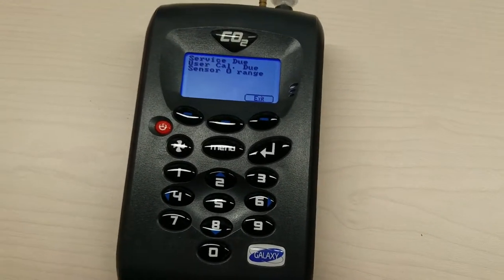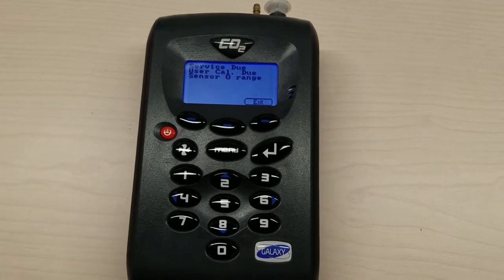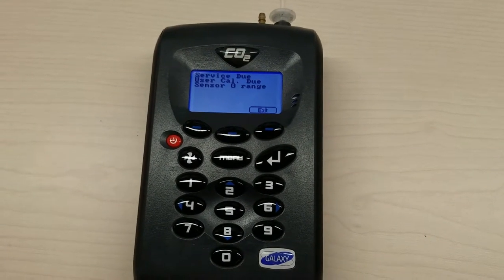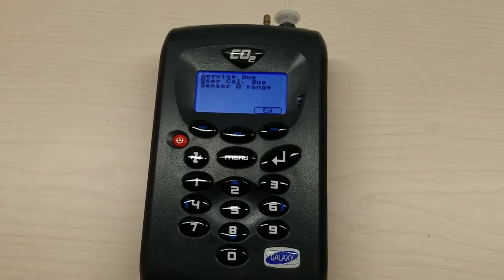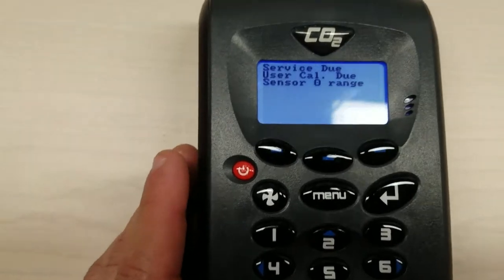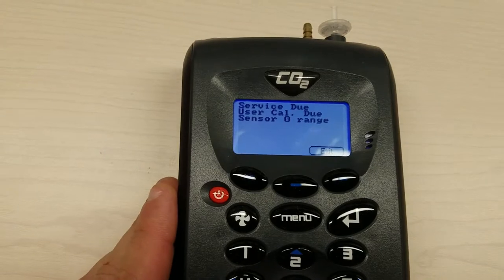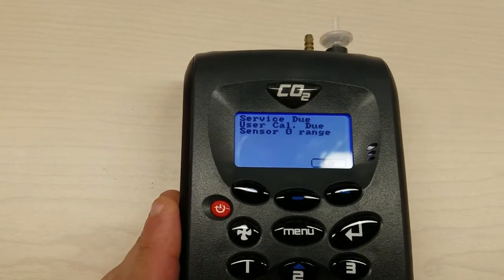The sensors and components inside the analyzer require annual calibration and maintenance from the factory. This is to keep the measurements accurate throughout the life of the instrument. So when you turn it on, you'll see this service reminder. That means it's time for a factory service.